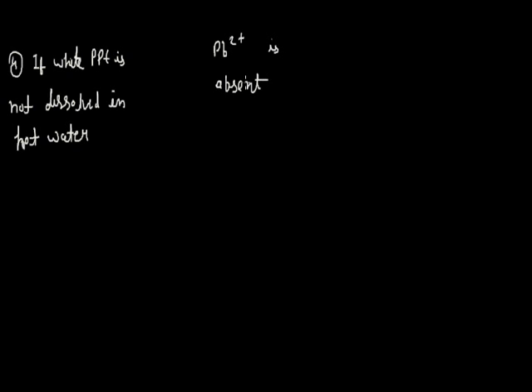Now further for the confirmation of Ag+ or mercurous, we are adding liquor ammonia, that is NH4OH solution, after hot water.